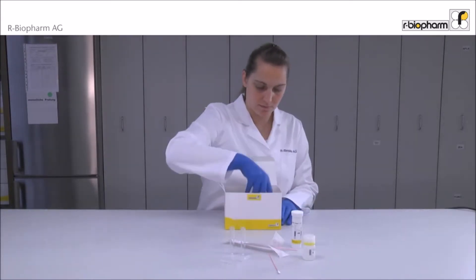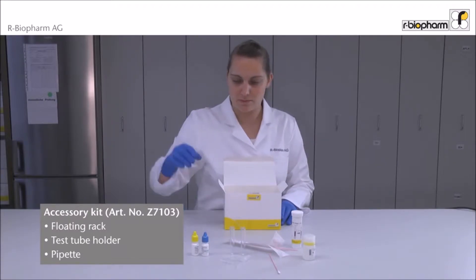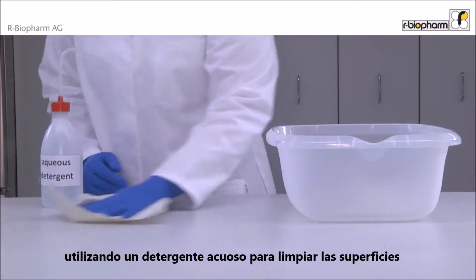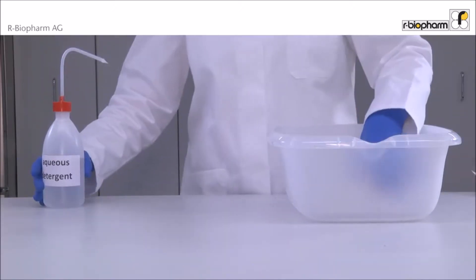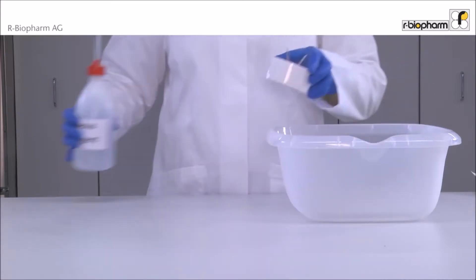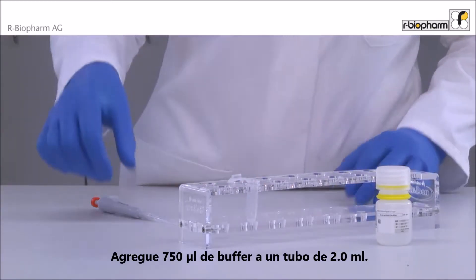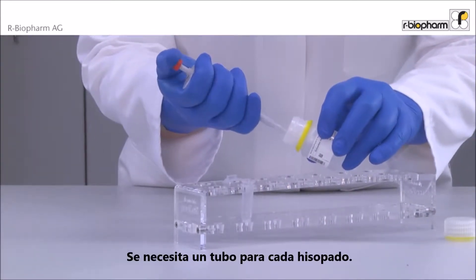It is recommended to use the accessory kit before starting. Make sure that surfaces and equipment are free from soy. Use an aqueous detergent to wipe surfaces and to rinse vessels. Add 750 microliters of buffer to a 2 milliliter vial — one vial is needed for each swab.